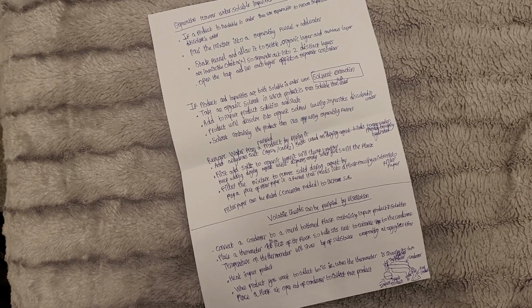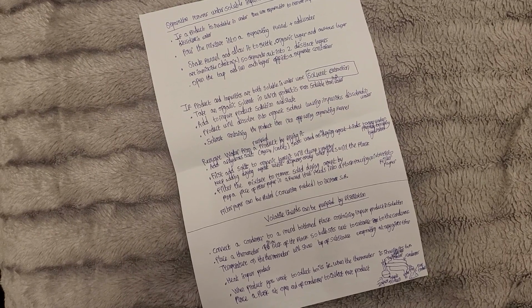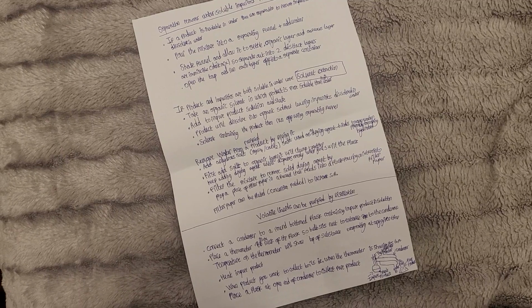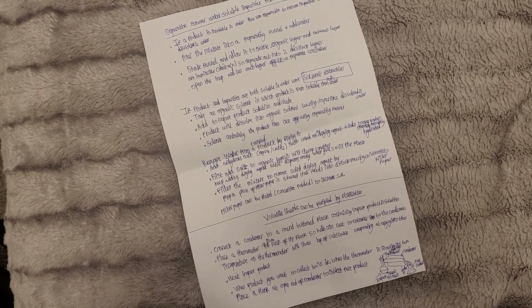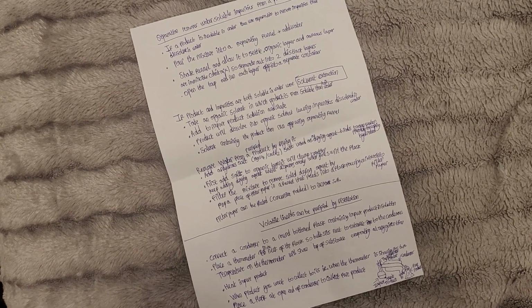Filter the mixture to remove the solid drying agent by popping a piece of filter paper in the funnel that feeds into a flask, pouring the mixture into the filter paper. The filter paper can be fluted, or folded, to increase the surface area.